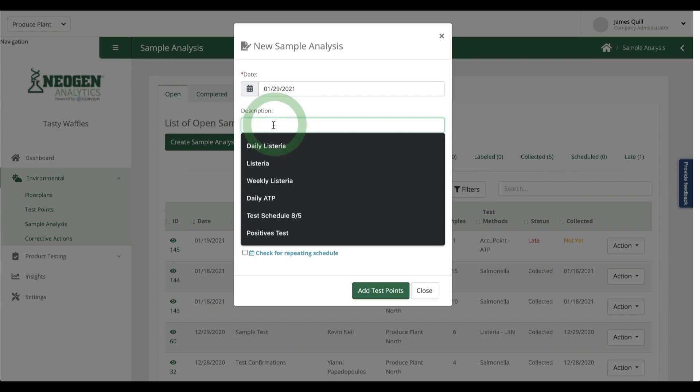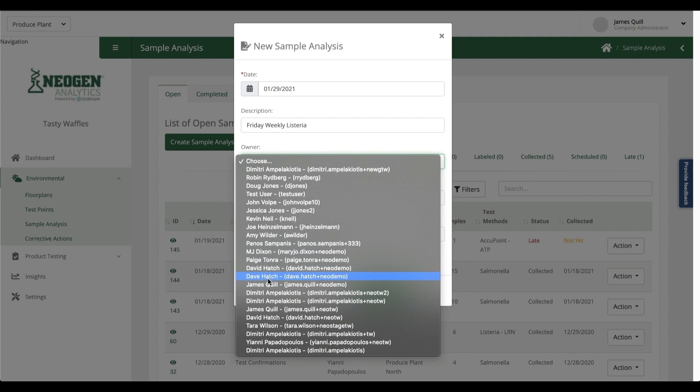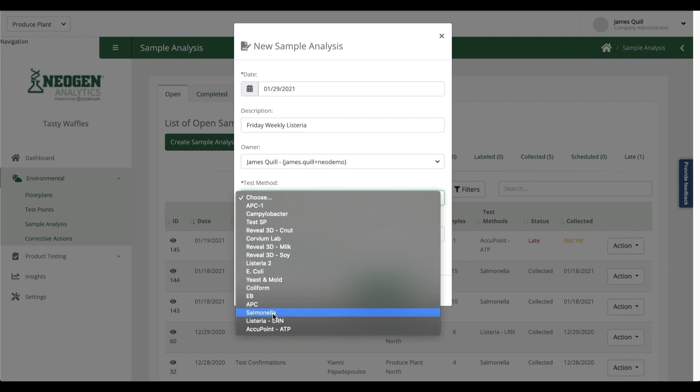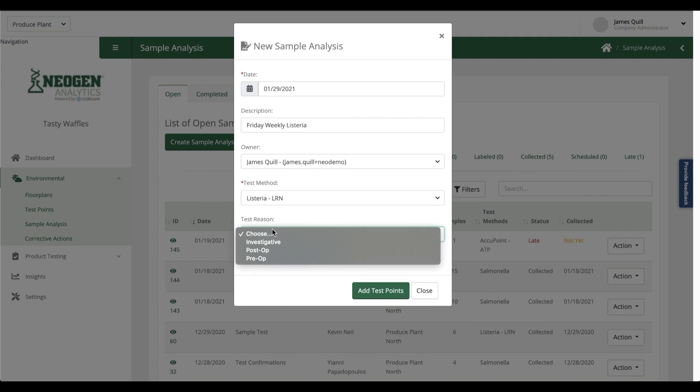First, I'm going to create a new sample analysis, and all I'm doing here is telling the system about my process. I'm giving it a name, assigning an owner, choosing my test method. You get the picture.